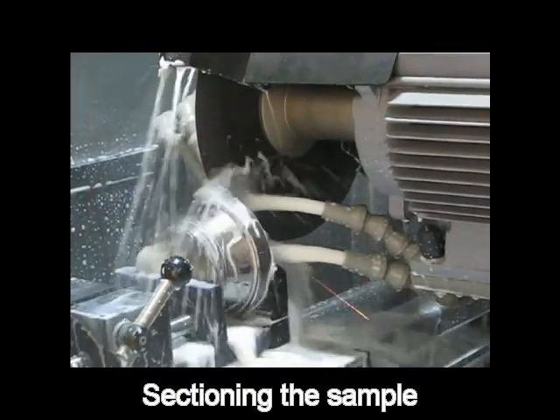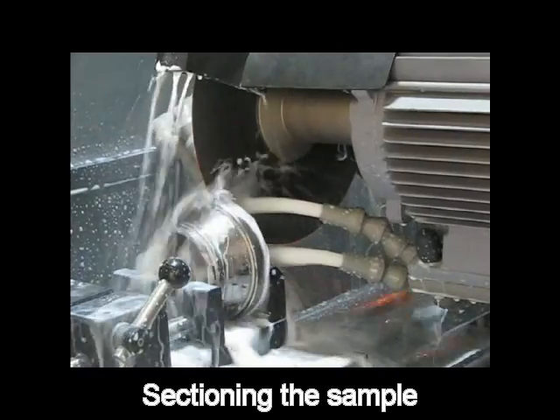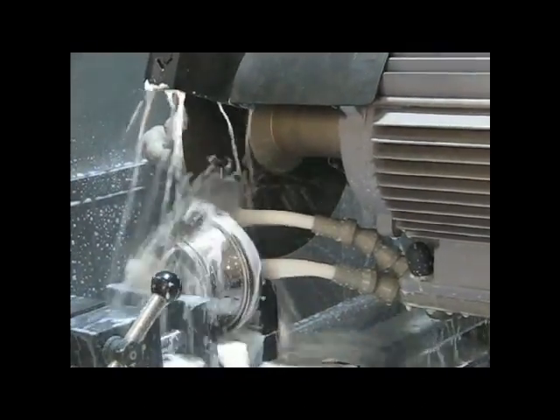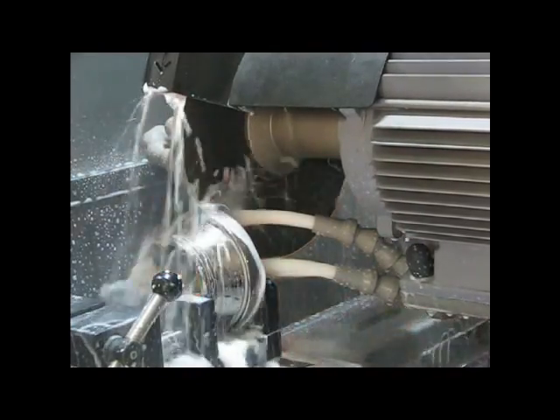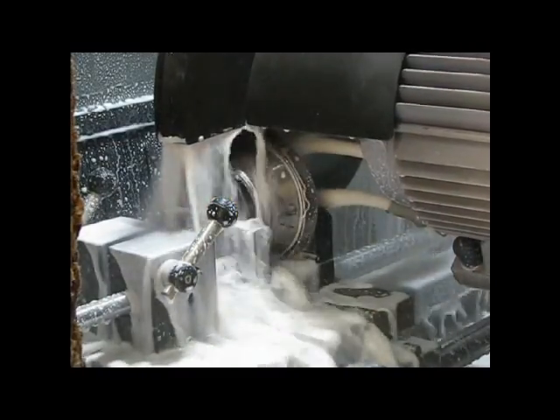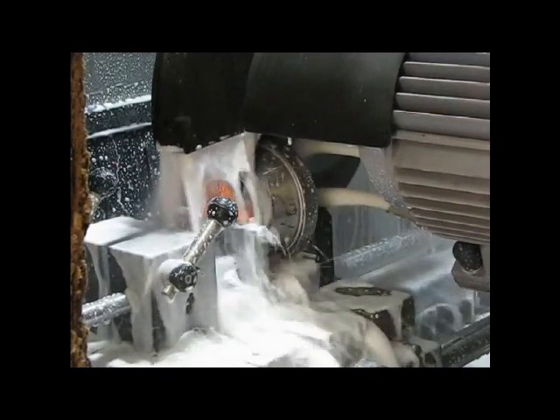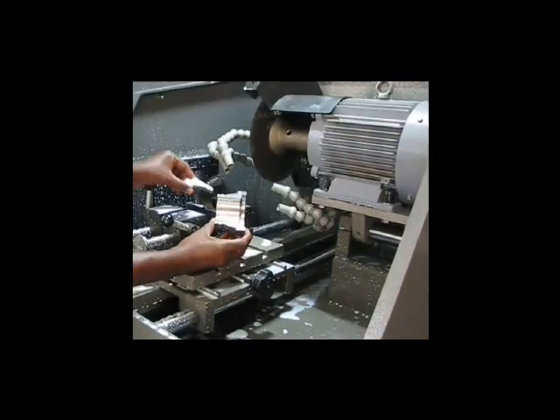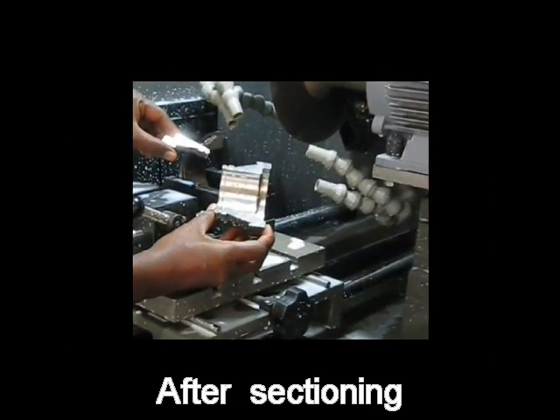Cutting operation is started. Cutting operation is completed. Let's check the cut sample. This is the cut sample after the cutting operation.